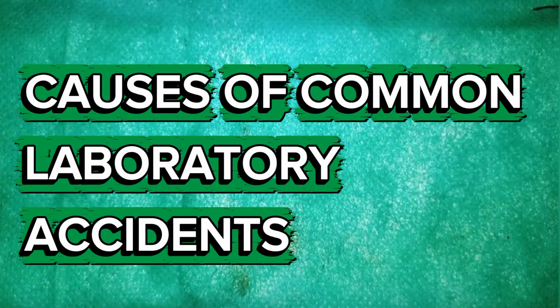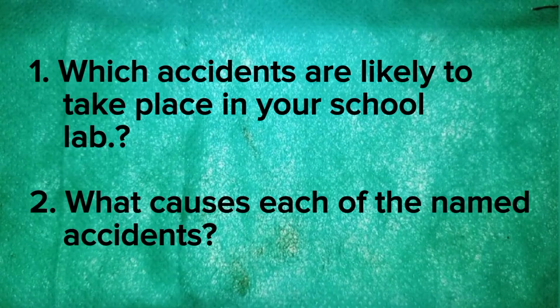Causes of common accidents in the laboratory, that is the school laboratory. Let us look at the school laboratory so that we can understand directly. For us to study this area, we have to ask ourselves these two questions. Number 1, which accidents are likely to take place in your school laboratory?